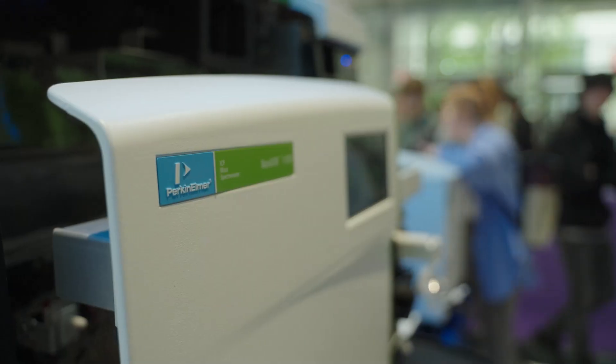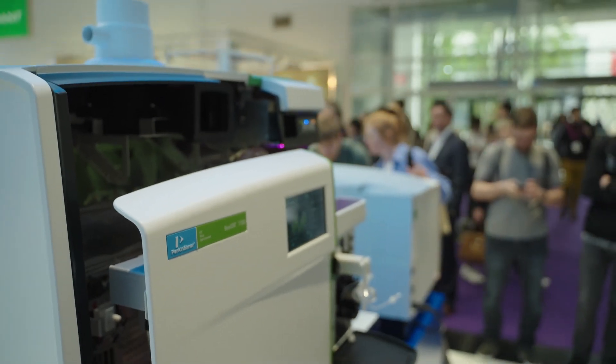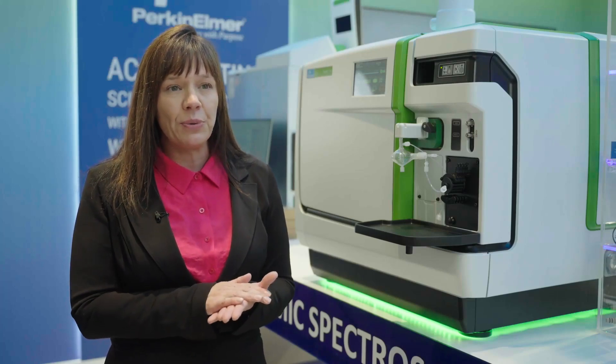Overall, the Nexion 1100 is our entry-level system, but as you've heard, it doesn't sacrifice performance. Moving up, we have our Nexion 2200, which just launched in September of 2023.